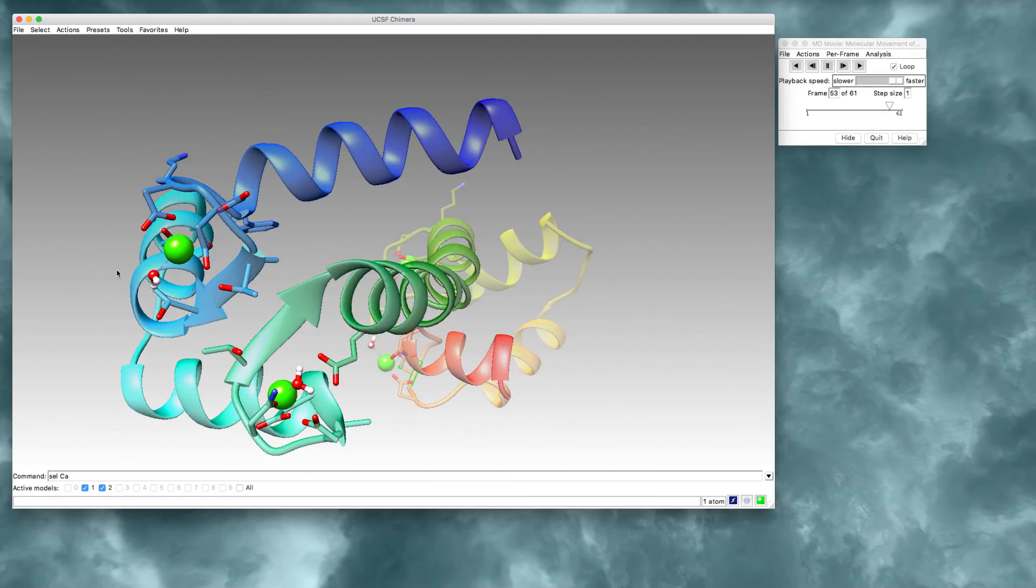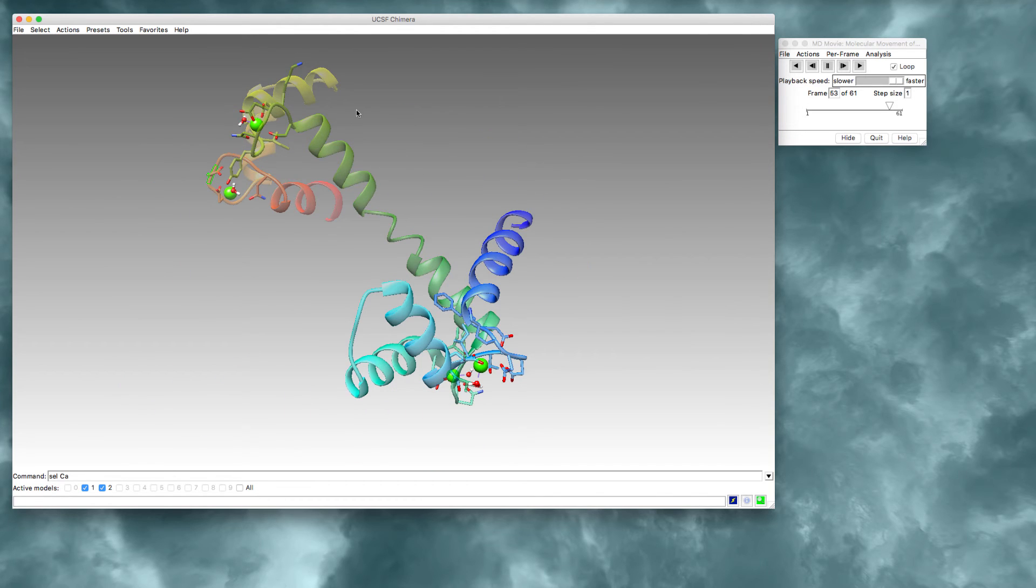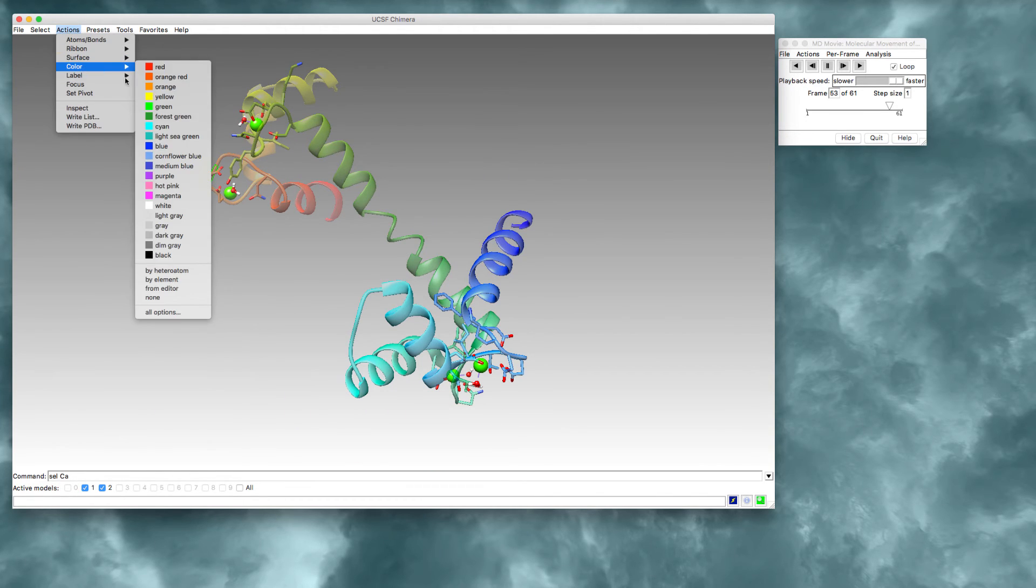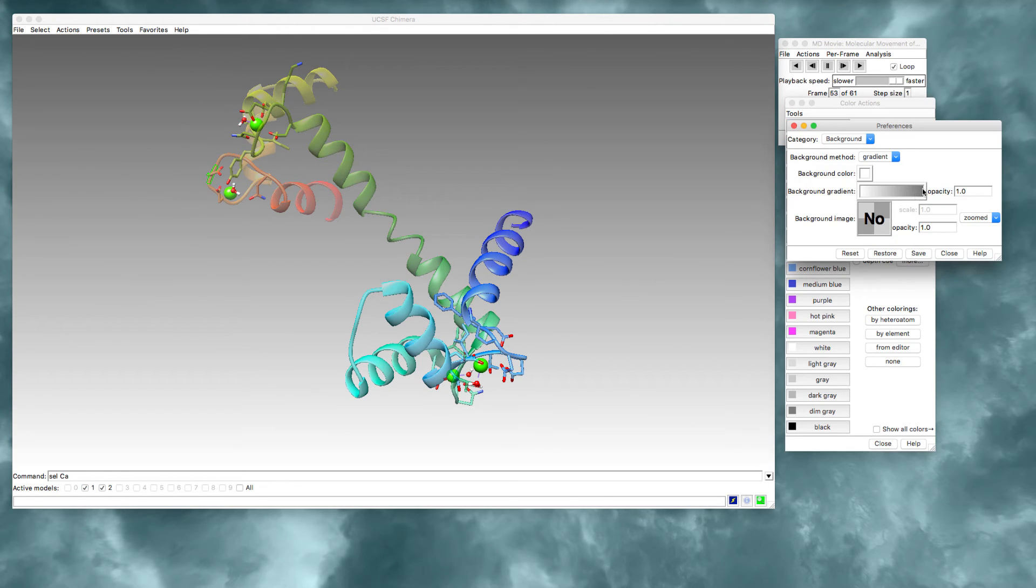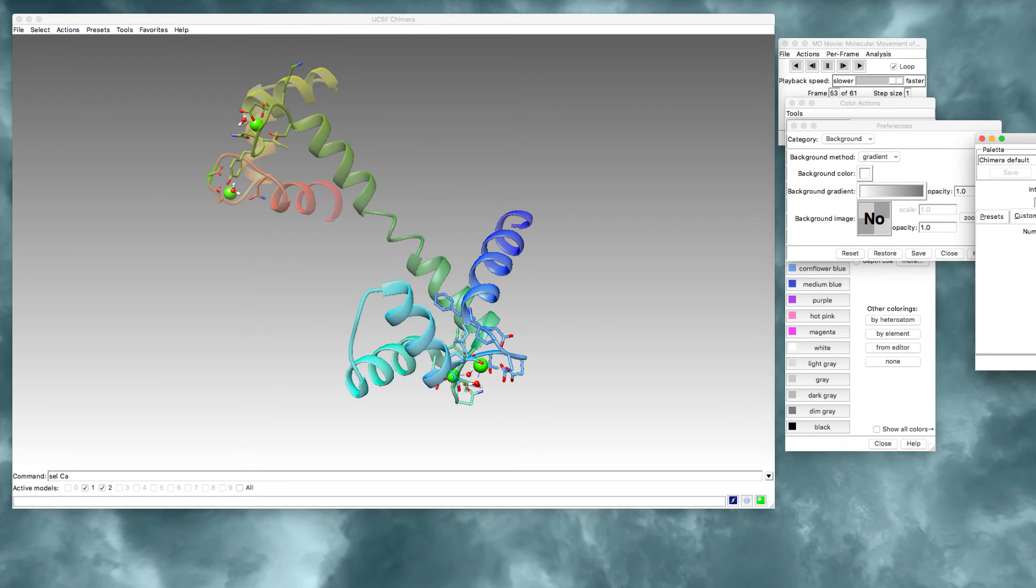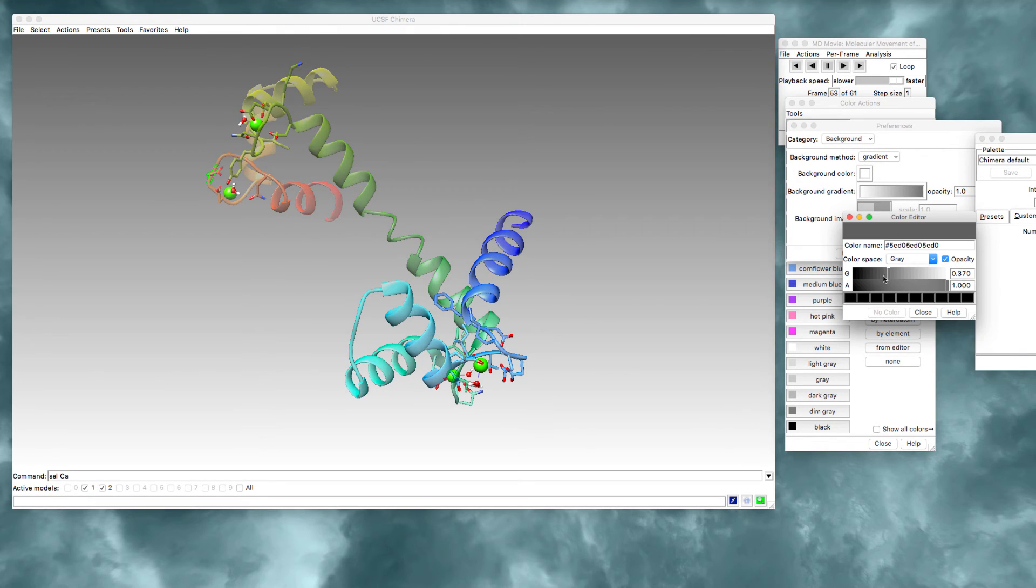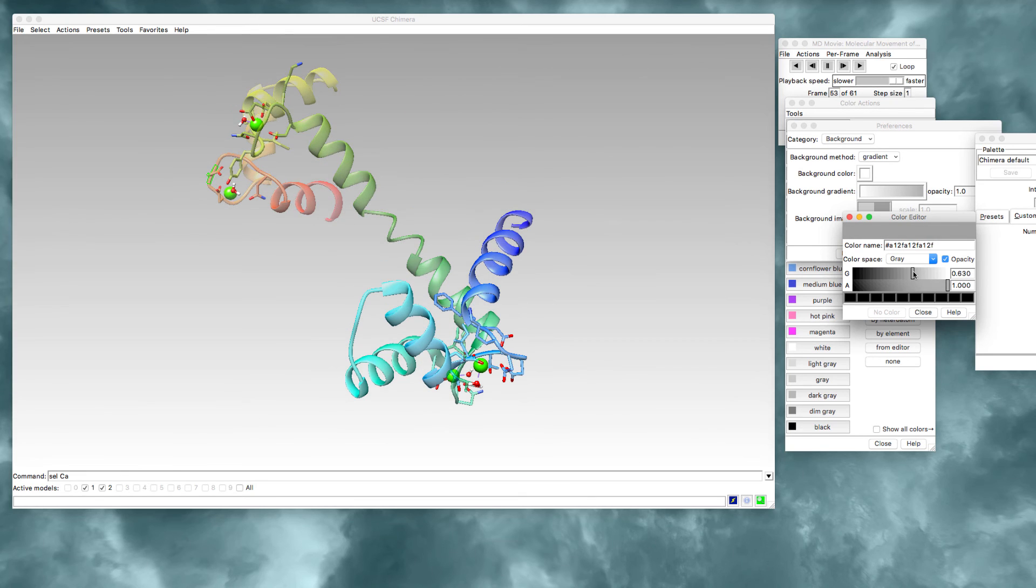I decided that this gray is a little bit too dark. So I'm going to go back into color and all options. I'm going to select the background again and go back in here and make this a little bit lighter. It's not quite so dark.